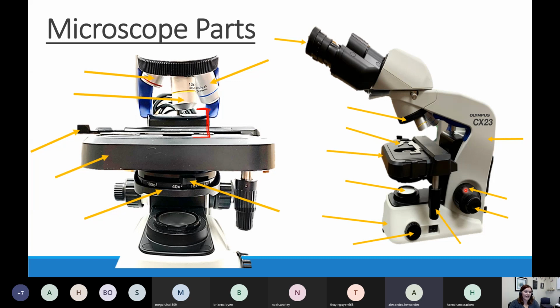Yeah, so Hugh asked about total magnification. We are getting there. To answer your question briefly now, we're never going to go higher than 400 times in our class. If you're taking microbiology, there is actually another objective that those microscopes would have on them that we do not have in our labs, since we don't look at anything quite as small as the bacteria. But yeah, good question.